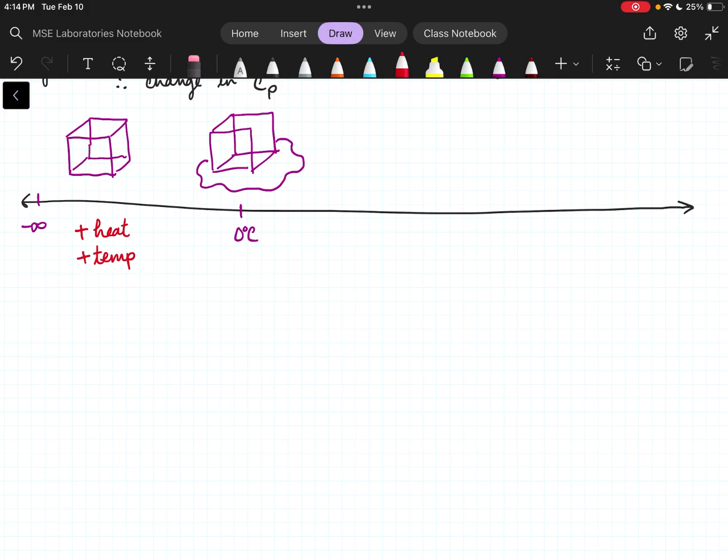This is heat capacity. How much energy or how much heat do I have to add for the temperature to start rising from negative 50 degrees Celsius to negative 49, to negative 48, etc.? Okay. So this right here, we're solidly in the heat capacity zone.